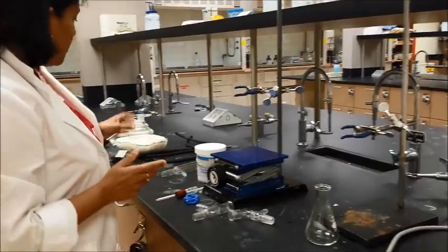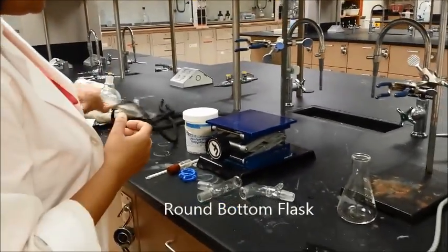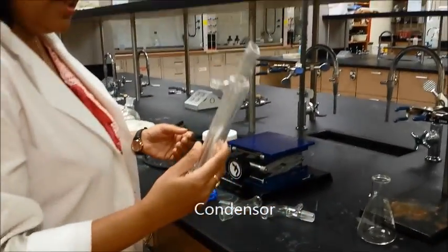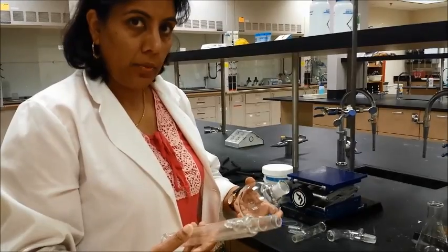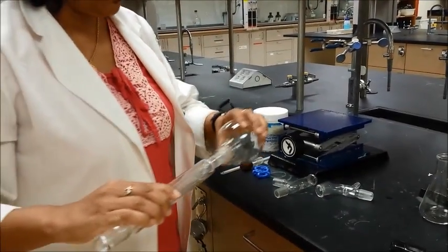Regarding the other glassware that you need, in addition to the round bottom flask, you will need a condenser. The joints we are using here for simple distillation are what we call ground glass joints, so everything will fit into each other — that's the important part.